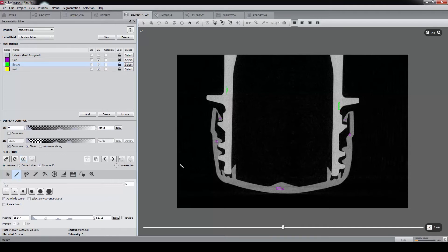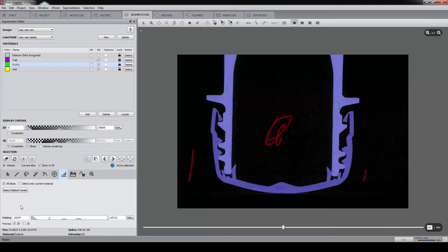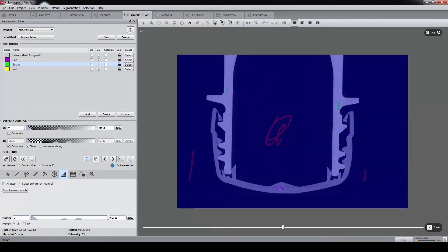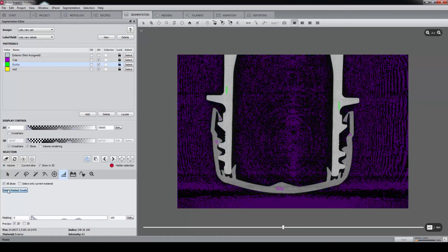And because we have inclusions here, between the cap and bottle, it's not easy to mark the outside air, so we use a global threshold. Let's say from 0 to 100. We press on Select Masked Voxels, and then assign the selection to the rest material.